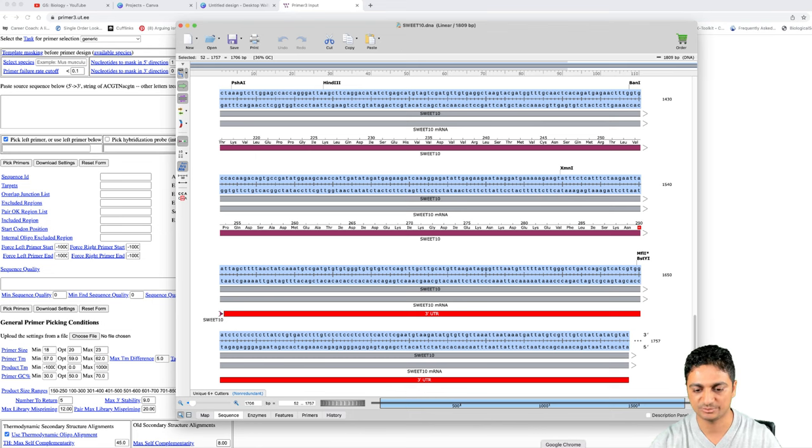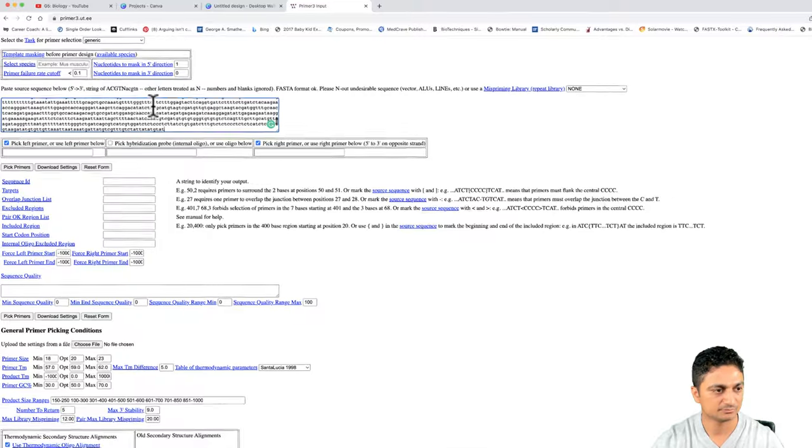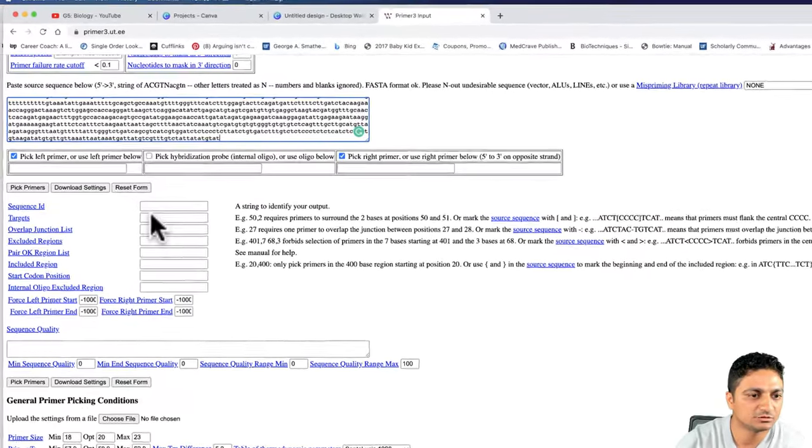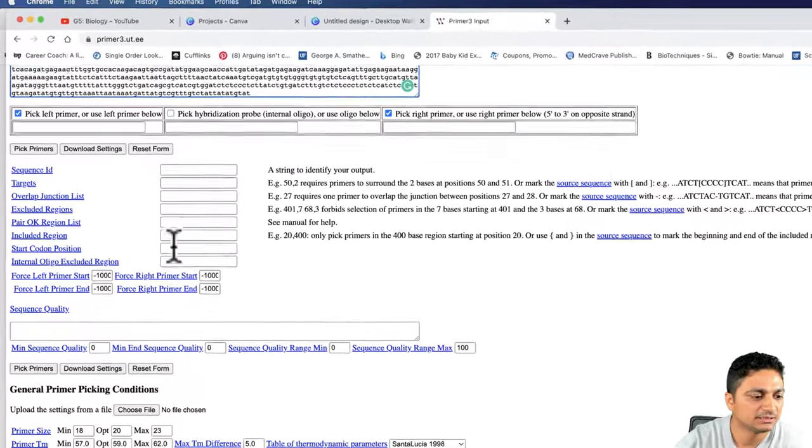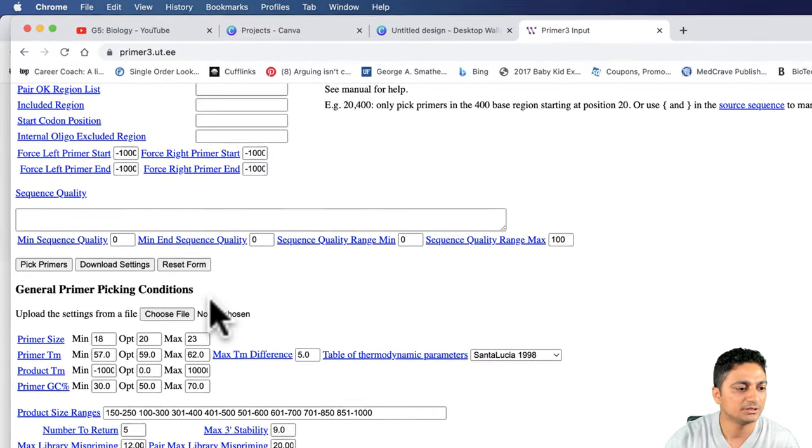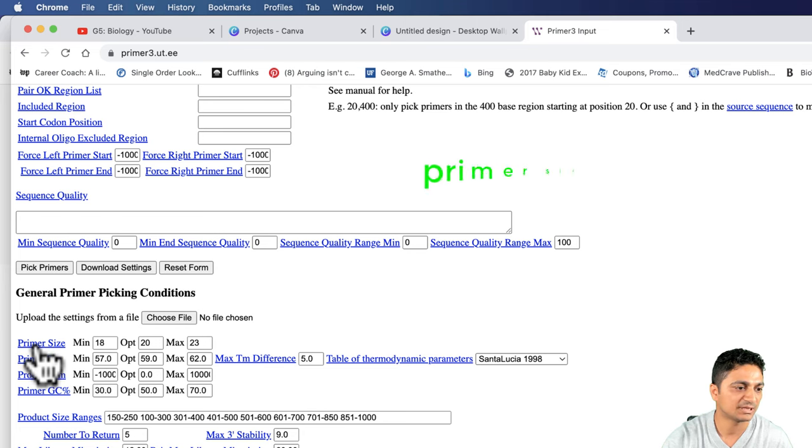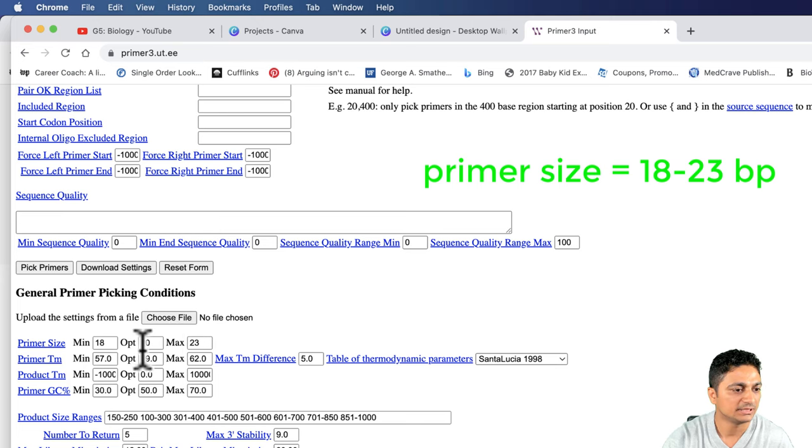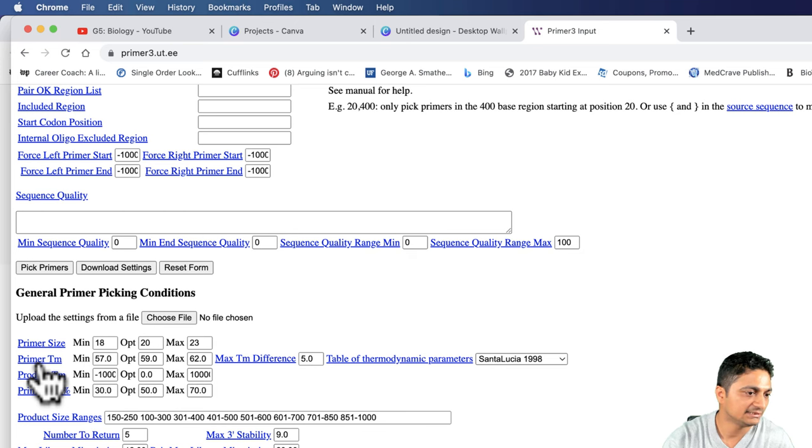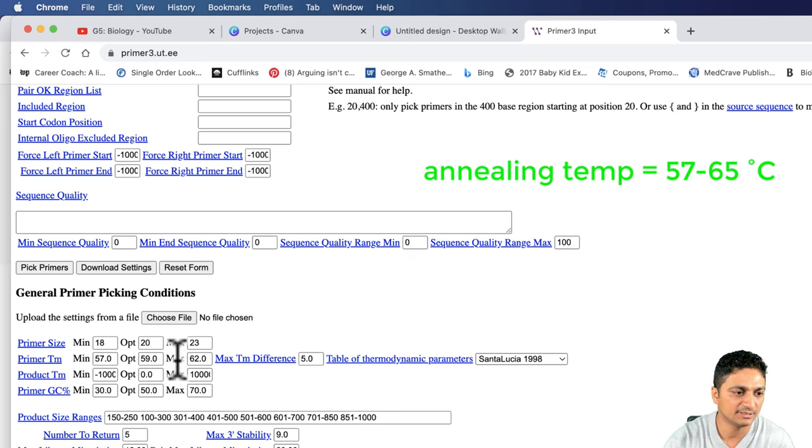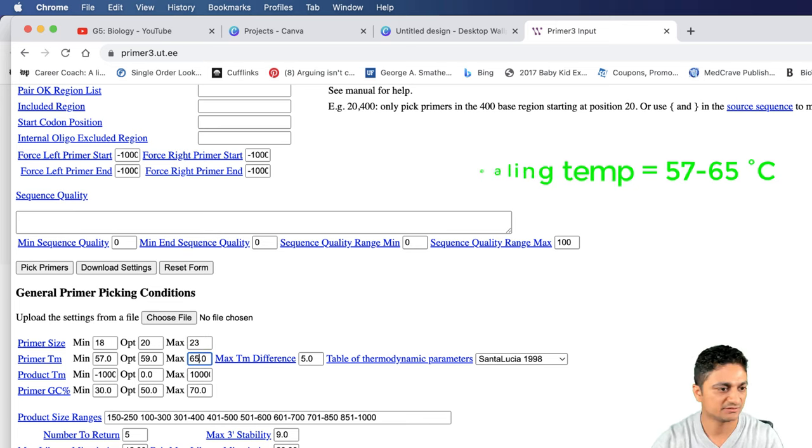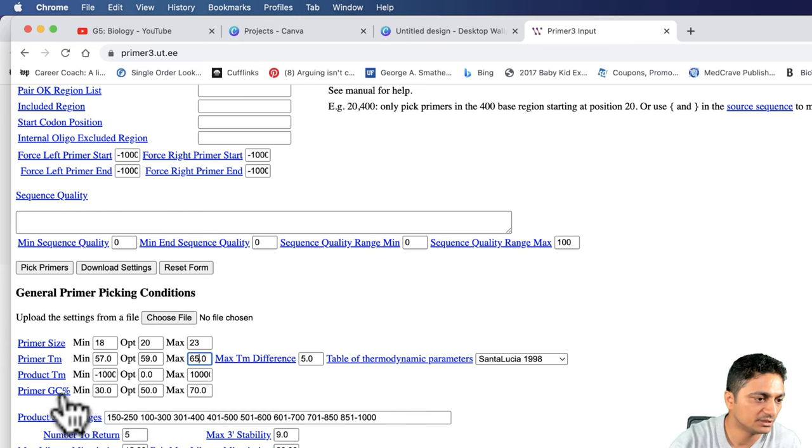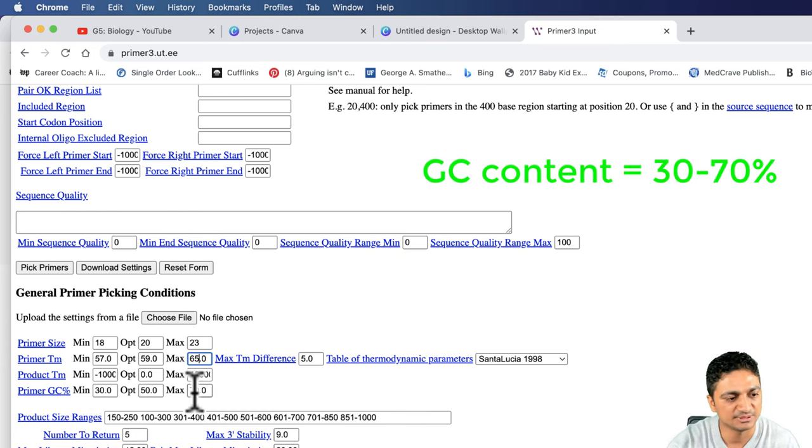I'm going to paste the sequence in primer3 online tool. Now there are so many things you can play with for designing the primer. However, we don't need to pay attention to all the details. Let's focus on the primer size. We can fix the primer size 18 to 20. 20 is the optimum and maximum is 23. Annealing temperature is 57 minimum, 59 optimum and maximum is 62. We can go this one up to 65. GC content of the primer is 30% minimum and maximum 70%.